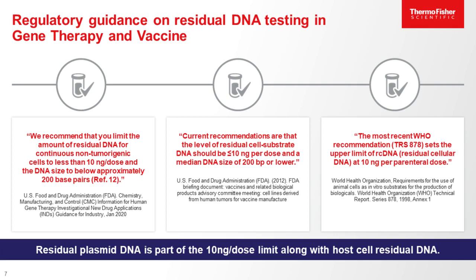Let us take a more detailed look at the regulatory guidance around residual DNA. Per FDA guidance for CMC for gene therapy IND applications published in January 2020, you limit the amount of residual DNA for continuous non-tumorigenic cells to less than 10 nanogram per dose, and the DNA size must be limited to below approximately 200 base pairs.